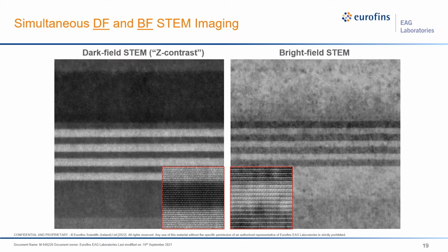Now, if you go to atomic scale, one thing very interesting is that in this quantum well type of structure, just based on the image contrast, you already see there are so many different types of materials involved, right? So you can immediately see that there are heavy elements involved in these quantum wells. So basically that is the good advantage of the so-called Z contrast image.